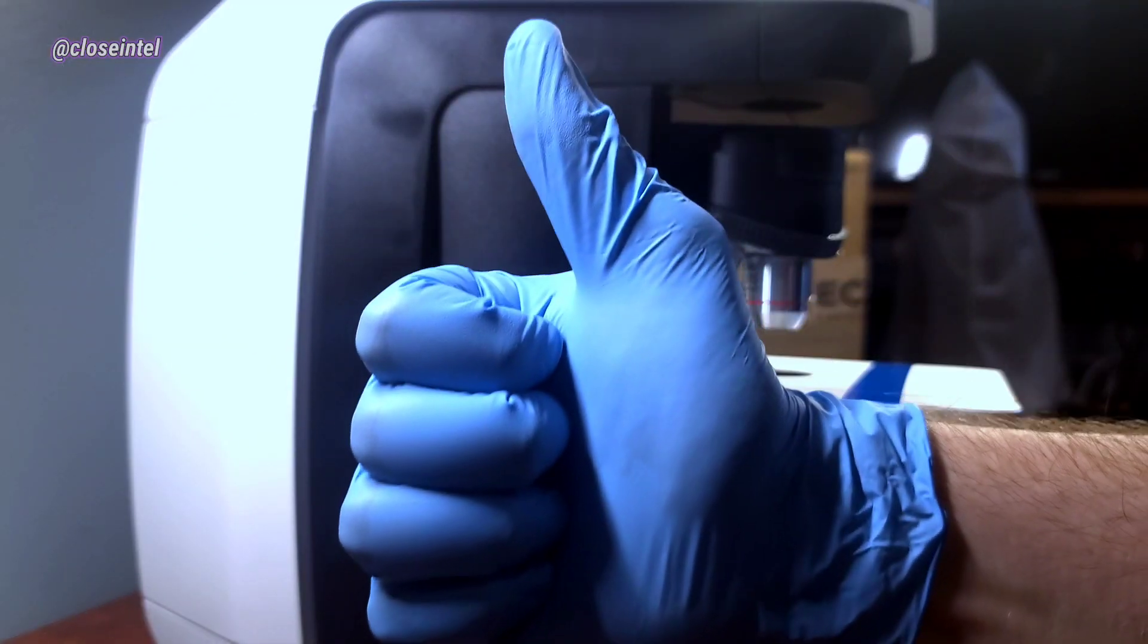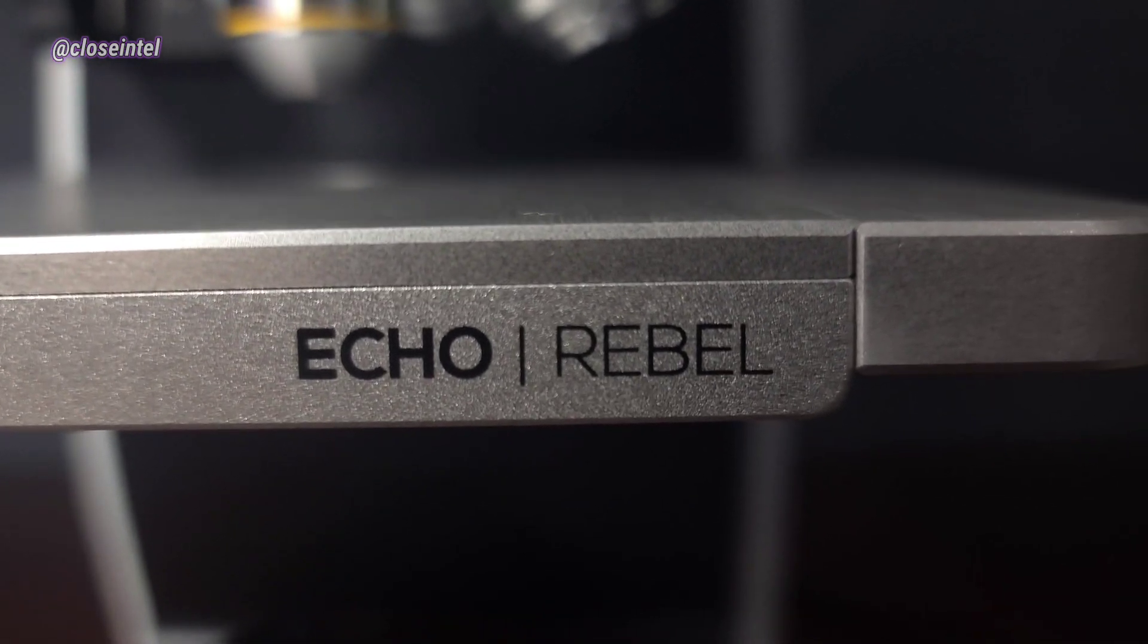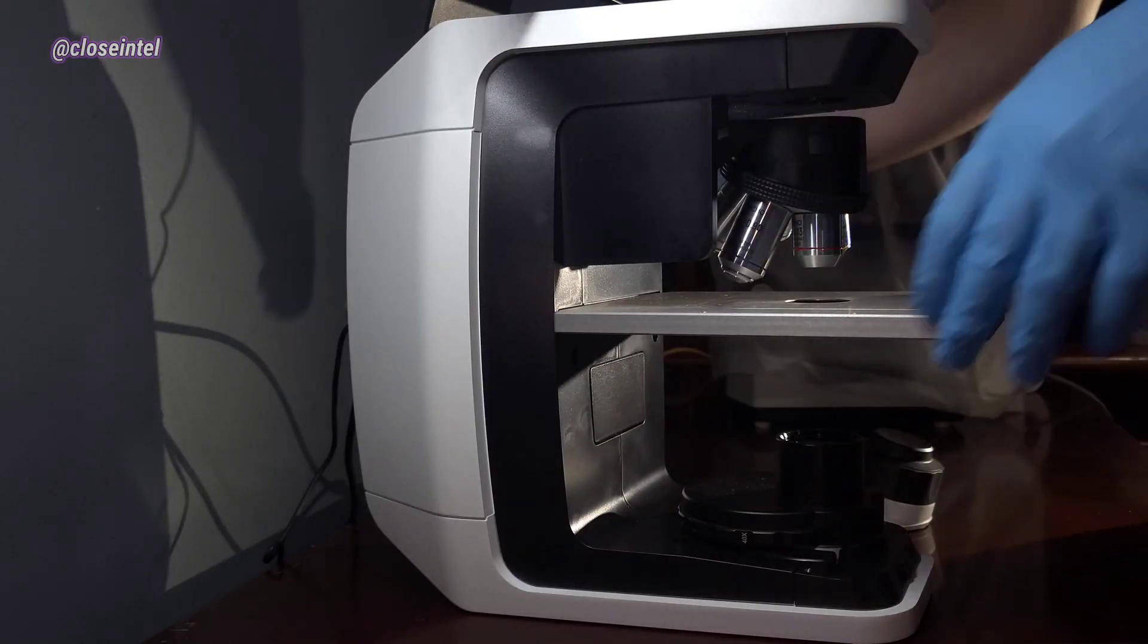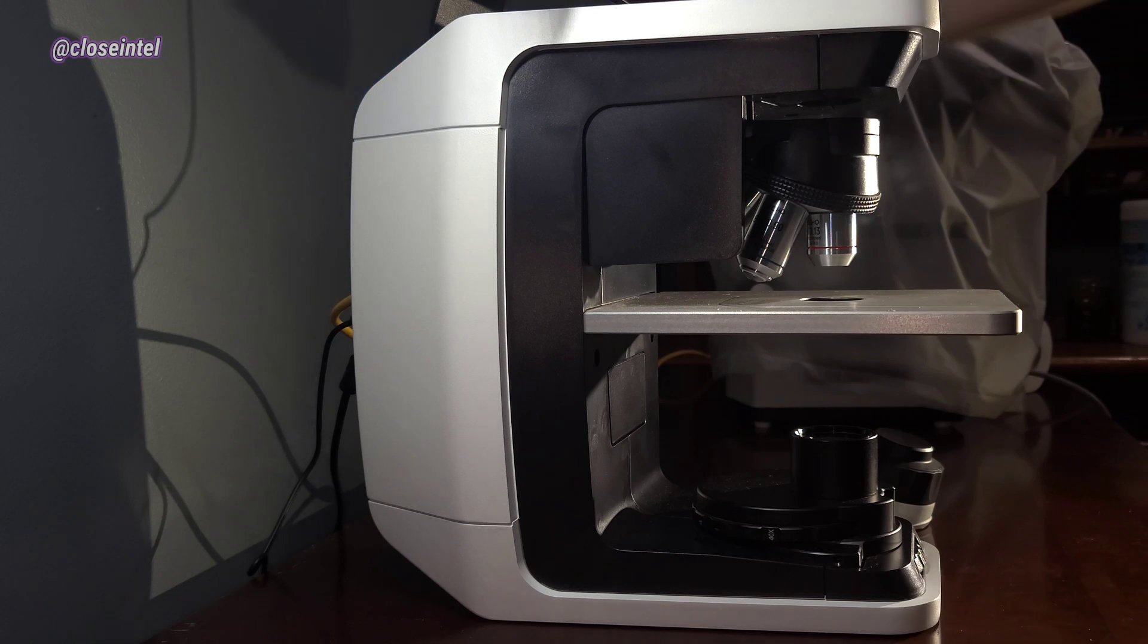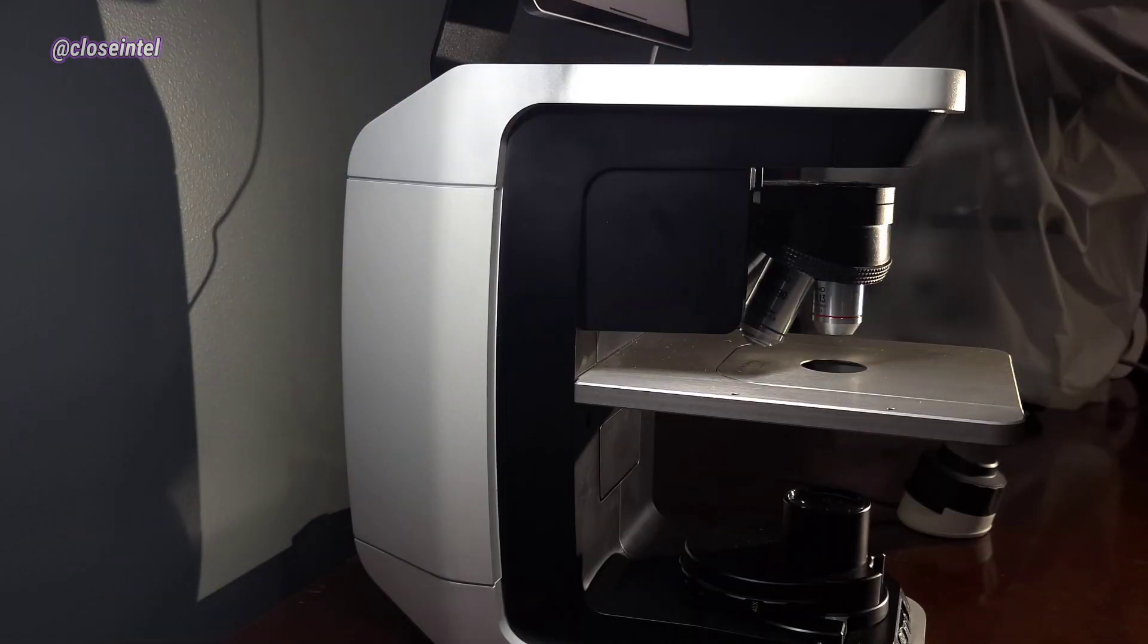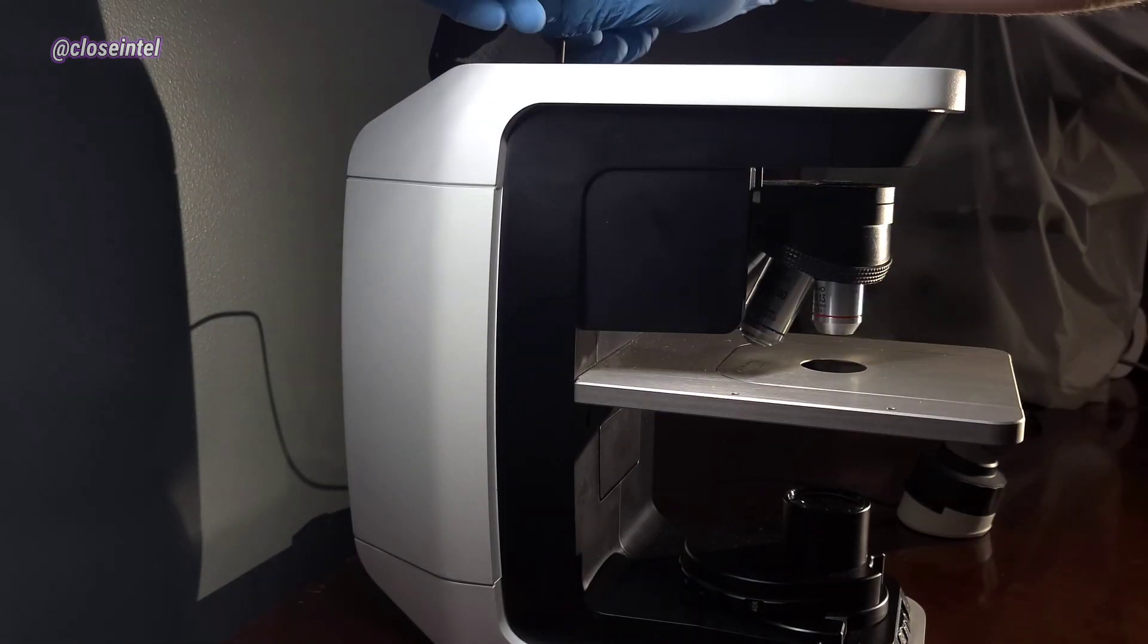Now the microscope will be ready to use and I'm going to show you some of the features as well. This is the Echo Rebel. The first thing that I want to show you is that this is technically two microscopes. It's the world's first and only hybrid microscope that can switch between upright and inverted.